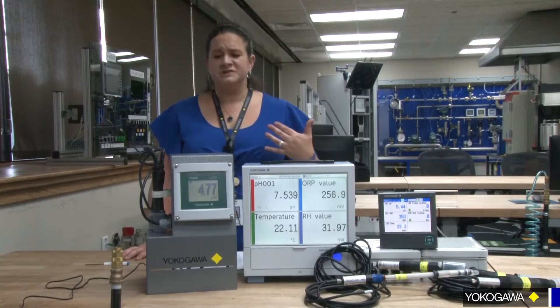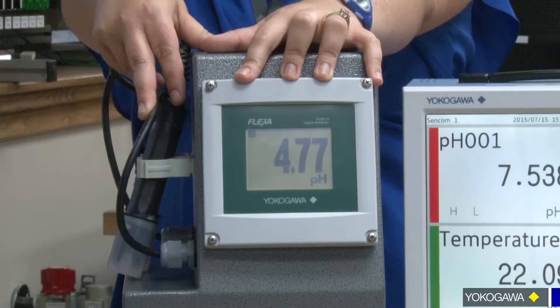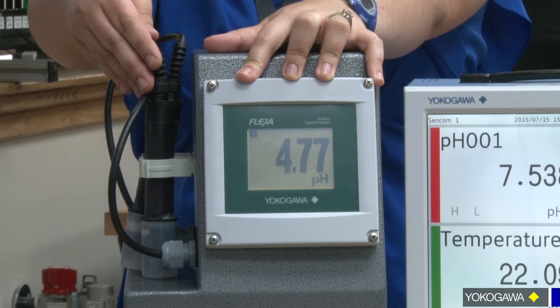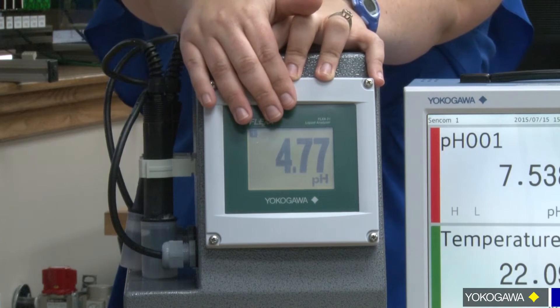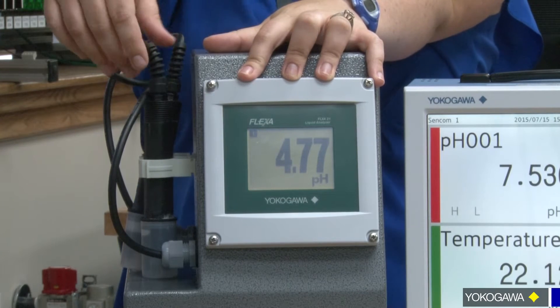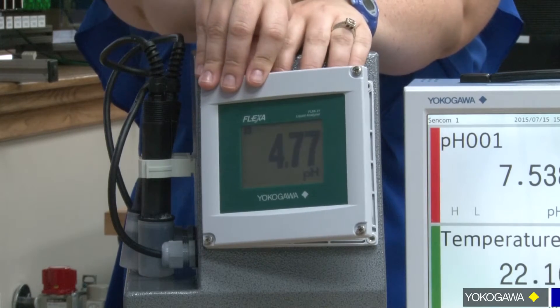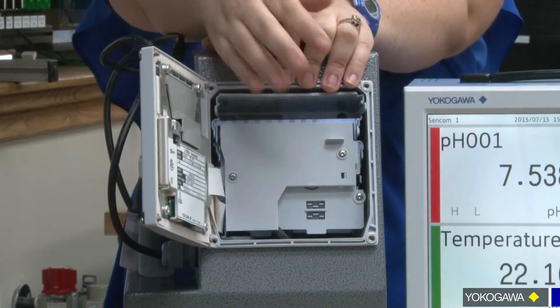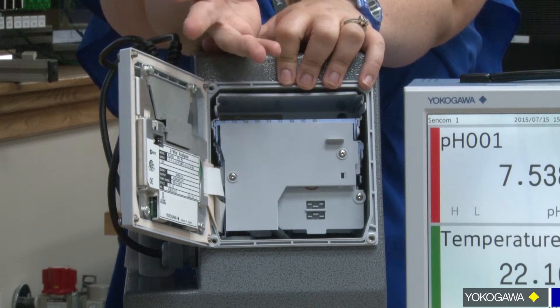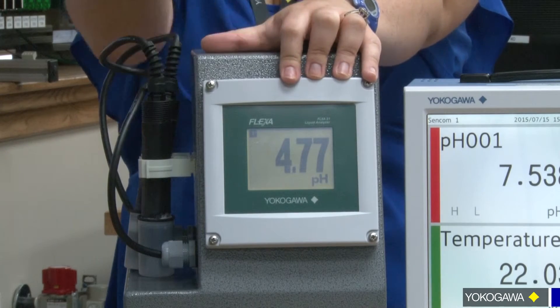First, in a traditional analog sensor, you would have a traditional analyzer and an analog sensor. The sensor will be in your process, it will read your pH or p-values and it will send the analog signal to your analyzer. However, when you go to calibrate, you have to calibrate in the field. When you have to replace the sensor, especially an integral one, you would have to unscrew the data plate, unscrew the cover, open it up, pull out any internal plates, change the wiring — obviously you've turned off your power so you don't electrocute yourself — put the new cable back in, shut it back up, turn it back on, and then you're good to go.